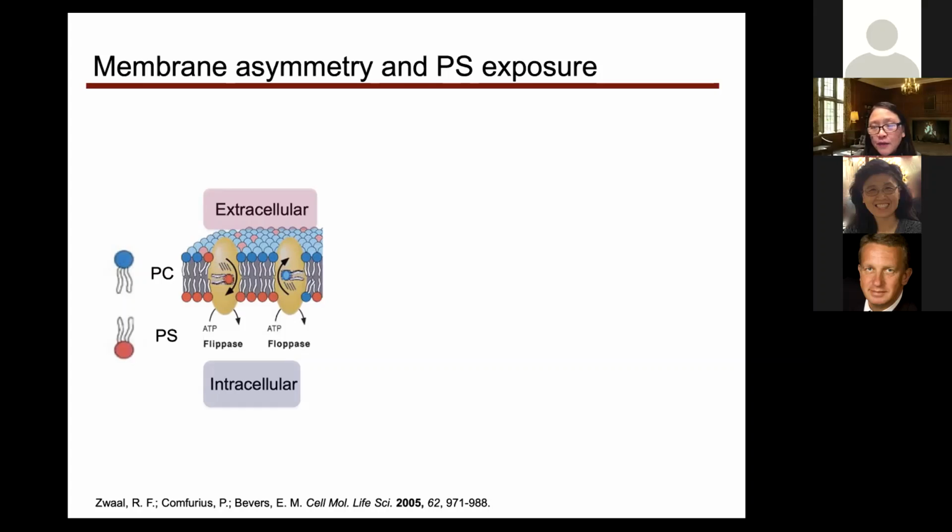So we have seen, for example, in a different system, which is also in beta amyloid, we do see packing in the beta sheet as they are forming this beta sheet as it is interacting with the surface. I don't know if that addressed your question, but given the geometry that we have, with the alpha-Synuclein packing on the surface, we do not see any ordering.